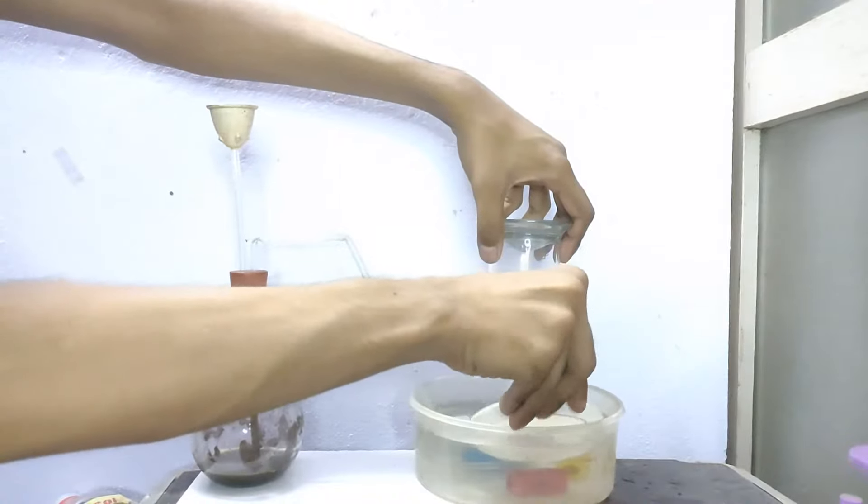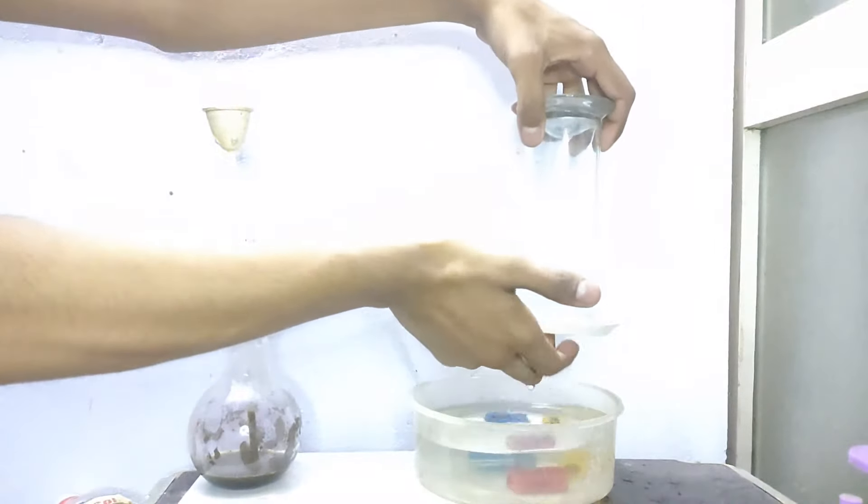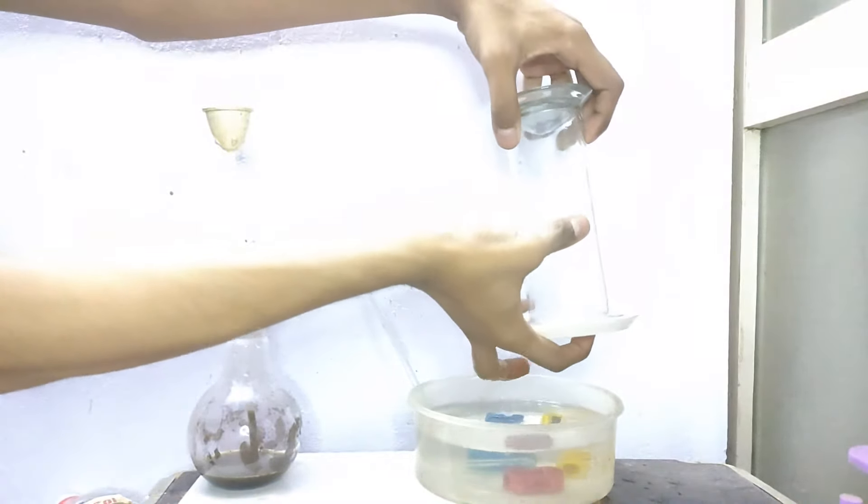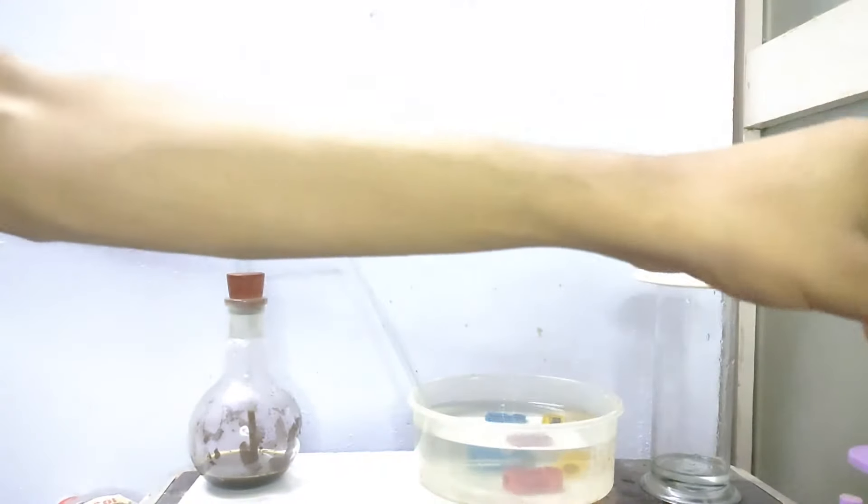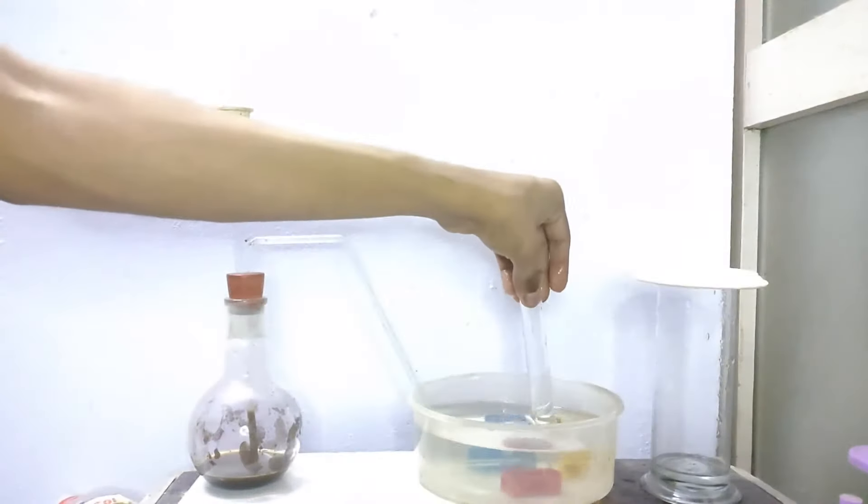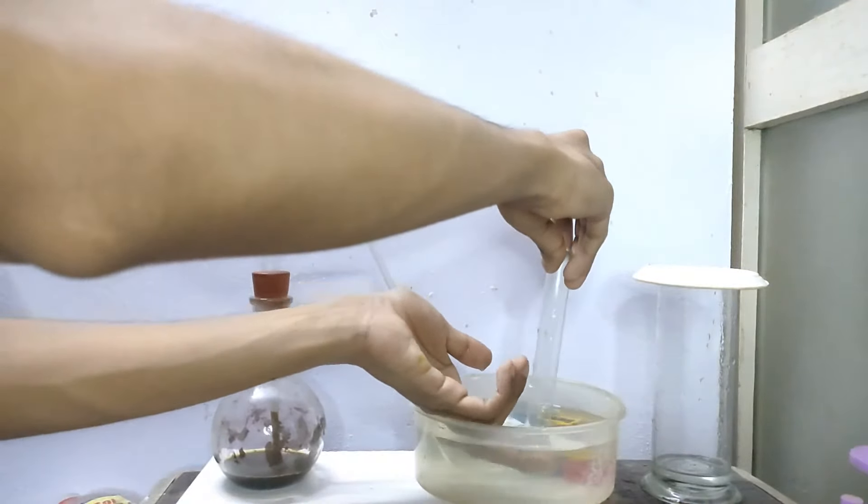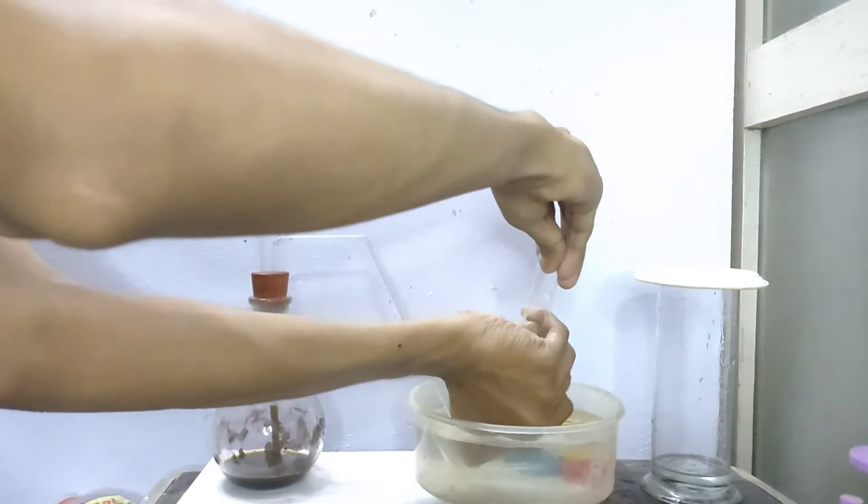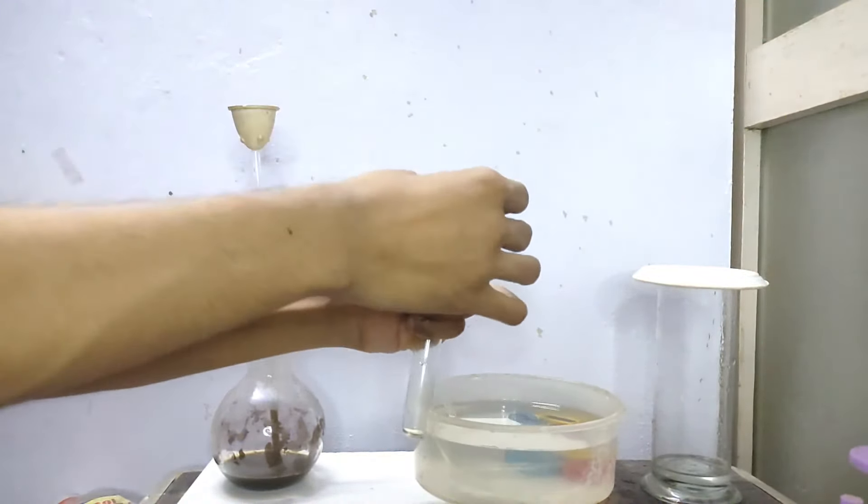So now our gas jar is full and I will take out the gas jar with the lid so that our oxygen does not escape out. And I am also filling a test tube with the oxygen gas. I will take out the test tube which has oxygen, cover it with the lid and then keep it aside for some time.